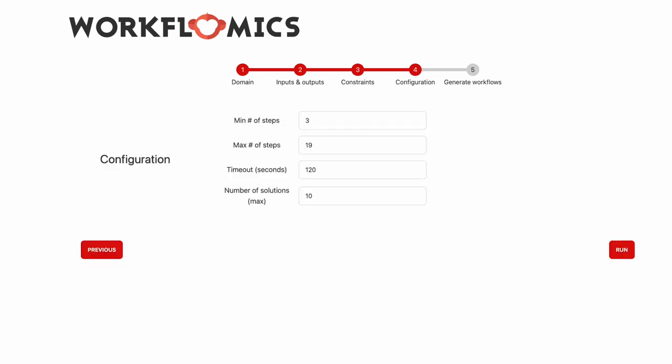Once we have specified our problem we can set the size of the expected workflows, the timeout that we are willing to wait, and the number of solutions that we want to compose. And we use the automated pipeline explorer to perform automated composition and to generate the candidate workflows.